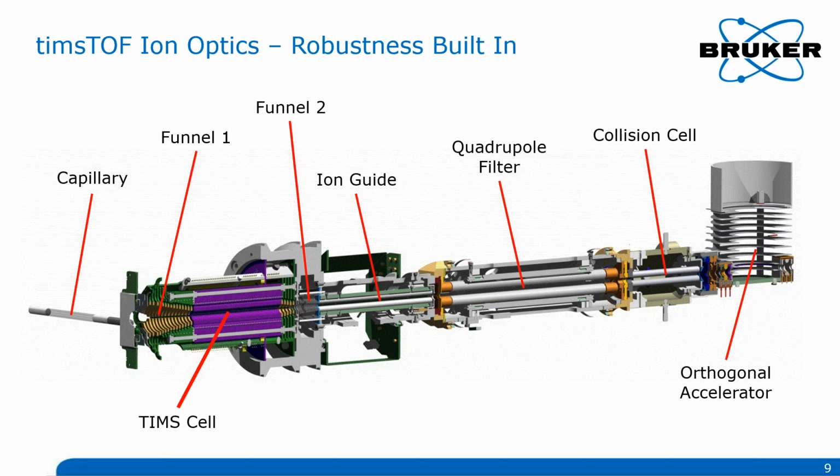It's a V reflection configuration with a thermal stabilization jacket, which means excellent mass accuracy and mass resolution of 60,000. The quadrupole filter and the collision cell for MS/MS experiments are optimized for work in unison with the TIMS. And the TIMS itself is what you see on the left. The cell is only a couple of inches long, but provides the ion mobility resolution of up to 200, in contrast to that 2 meters long tube that we showed on the previous slide.